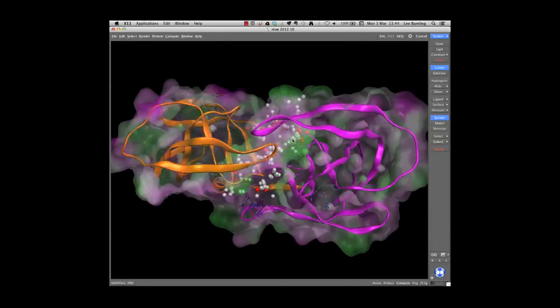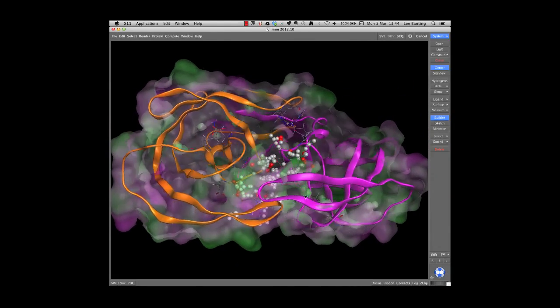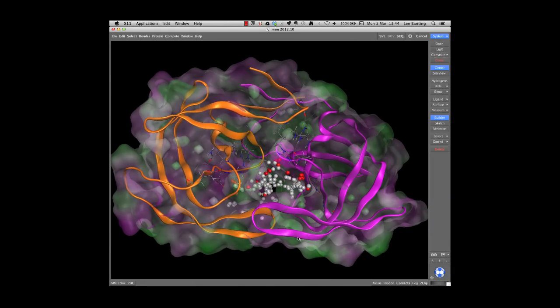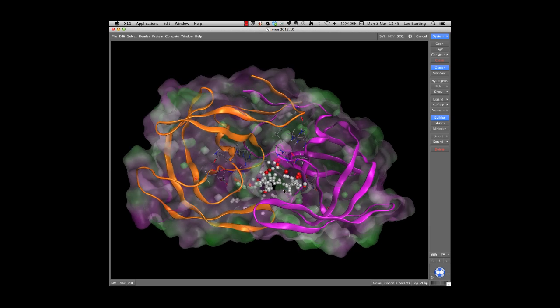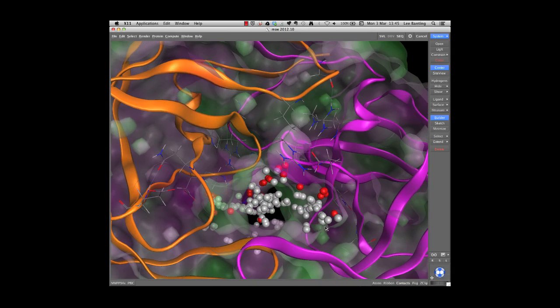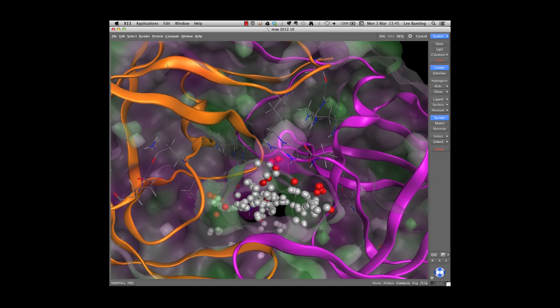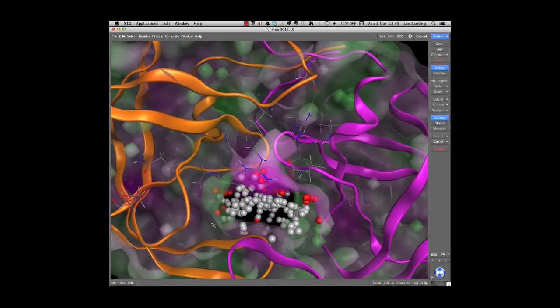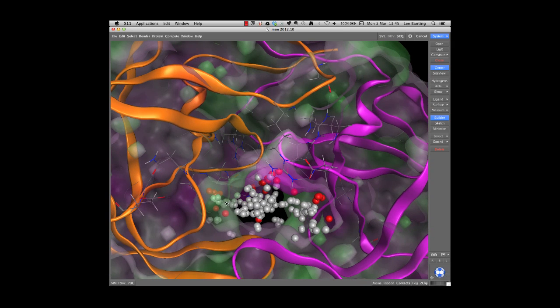And then other regions, if I can find an appropriate region, maybe you can't see it so well here, but let's try. So here, where you have a collection of white spheres, you will see that there's a green region surrounding these white spheres. So this is green here, all through here, and actually there's a green patch here next to these white spheres.